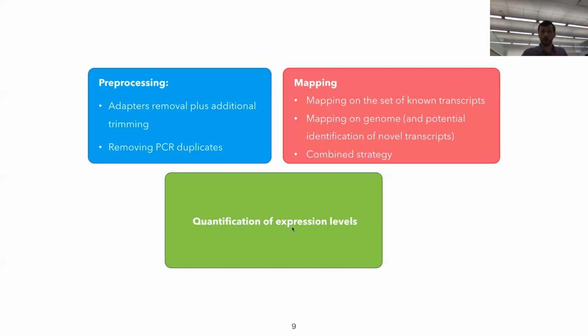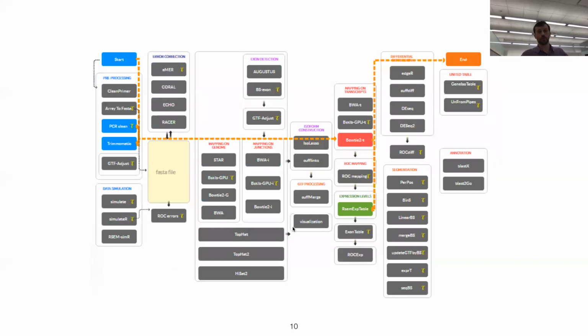Well, so now, why don't we try and do what we are doing here as a pipeline. As you remember, last time during the workshop, we used a demo pipeline. So we'll first do that, but then I want to show you how to upload some data, where to find that data, and how to prepare a pipeline because it will require several additional steps. Last time during the workshop, we prepared this as a mapping on what, right? I'm going to ask you some questions just to see how clear everything is. But I will show you two different pipelines, and let's see what the differences are.